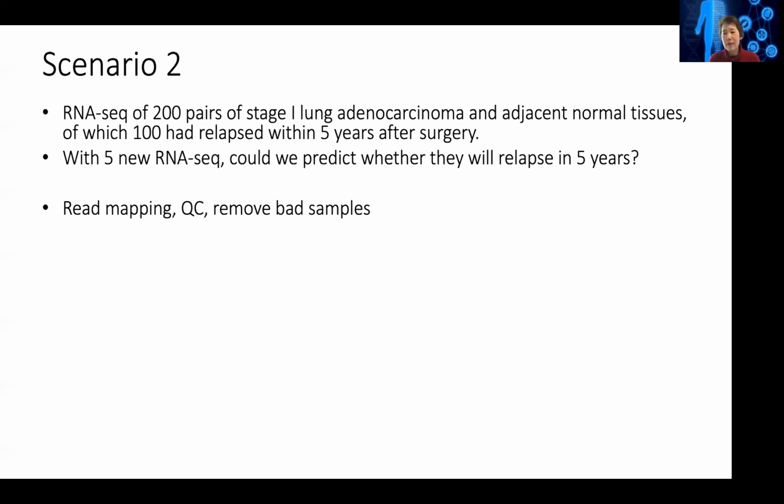And if the data is good enough, like just based on initial analysis, you see that, because a lot of times the bad quality samples in the PCA will show as outliers. You could potentially just run Salmon and then run PCA, and you say, okay, these samples look pretty good. Clearly there's a separation between cancer and normal, and then you can just run RSeQC just on the few outliers, and you decide, oh, these are clearly outliers. You can just remove them as bad quality samples.